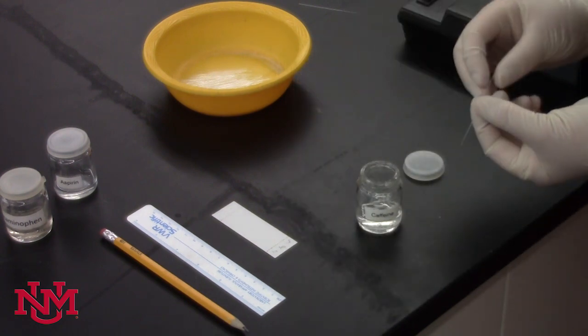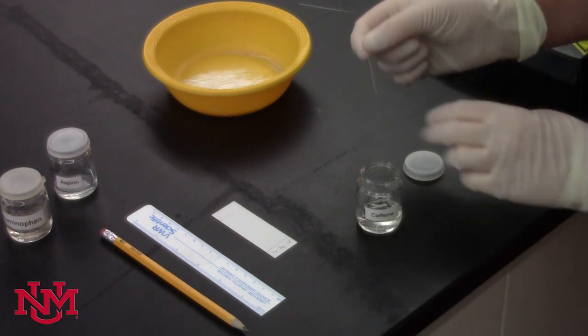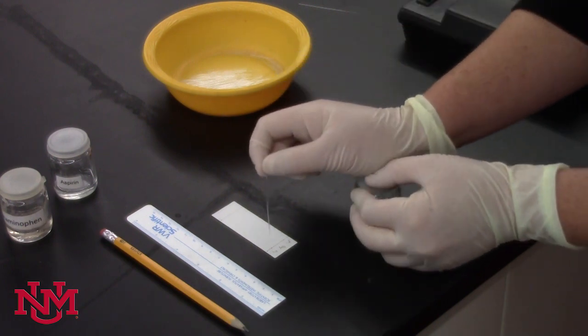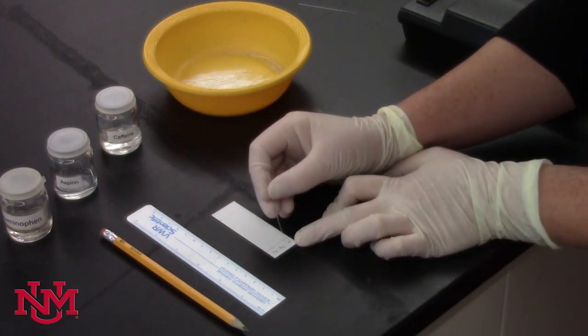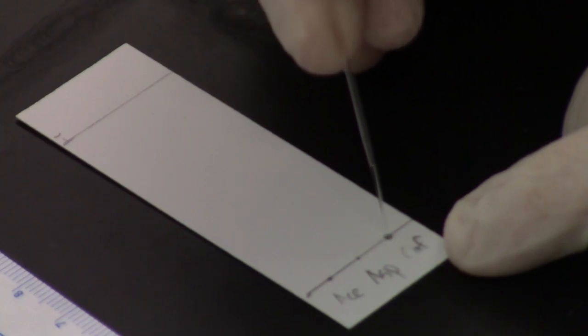Finally, we have caffeine. Take a third spotter, dip it into the caffeine sample, and spot the caffeine spot. Again, touching it just a tiny little bit at a time until you've transferred material there.